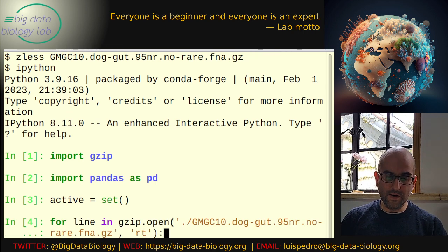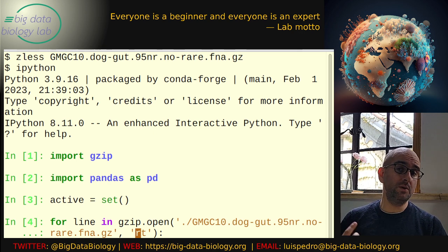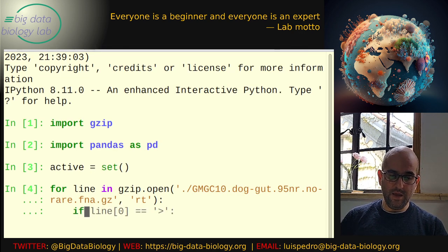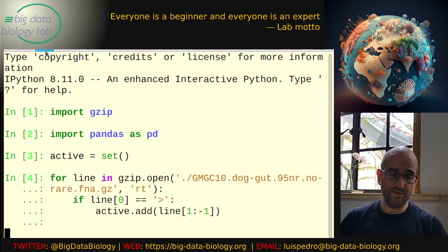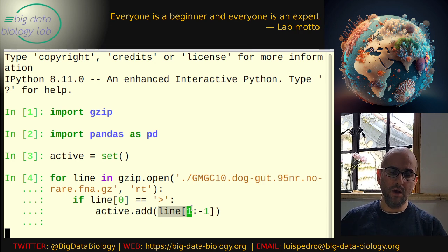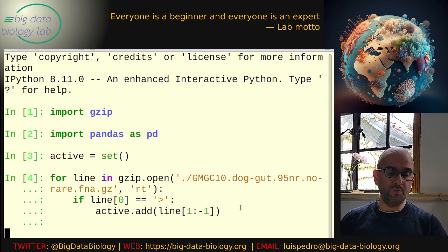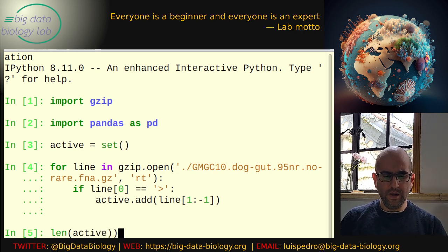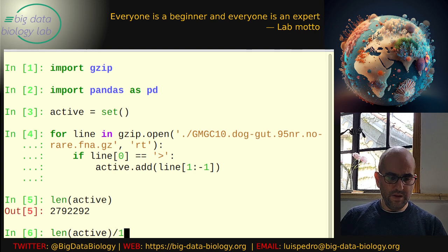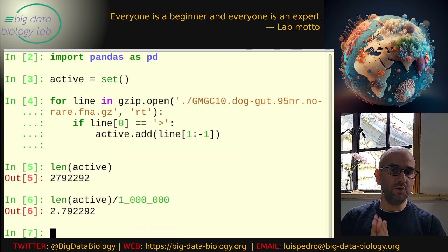We're going to parse this FASTA file. I'm just going to open it — it's a gzip file, so I need to open it in read text mode. If the first line is a header line, I'm going to add that identifier to my active set. I just skip the first character (the greater-than character) and skip the last character (the newline character). This parses the file and gets the identifiers into a set of active genes. As you can see, it's about 2.8 million genes in this set — less than one percent of the whole big catalog.